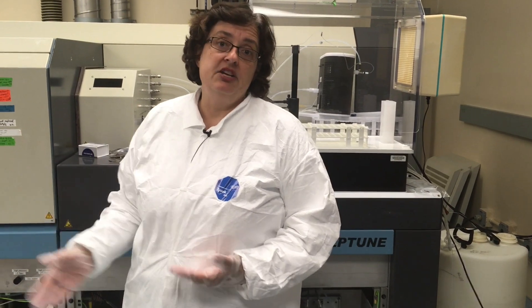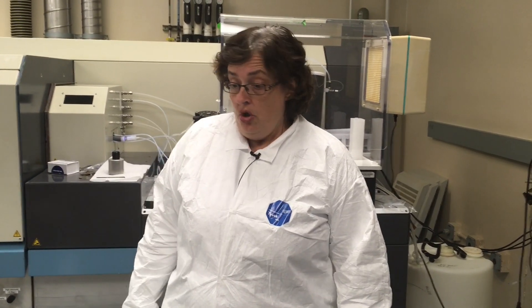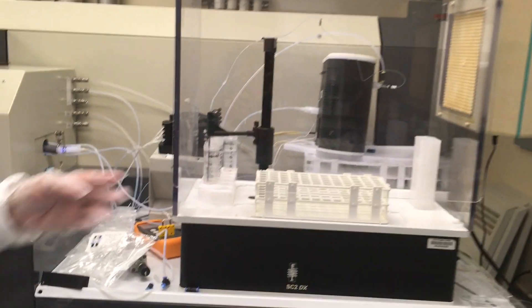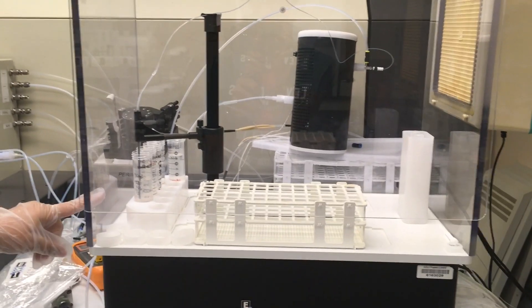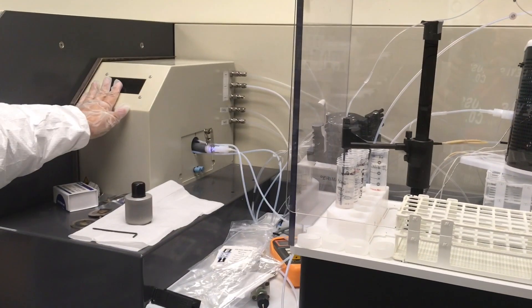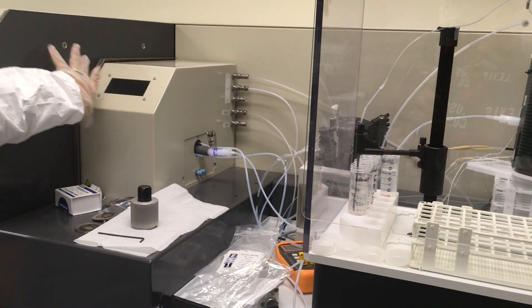Another application is studies in humans — biomedical studies. We've been working on calcium isotopes naturally occurring in urine and blood as an indicator of how much bone you're either forming or resorbing. We've done studies in astronauts. The front end of this instrument is actually much like the quadrupole: a probe goes into a tube, through a nebulizer, and then through the ICP into the instrument.